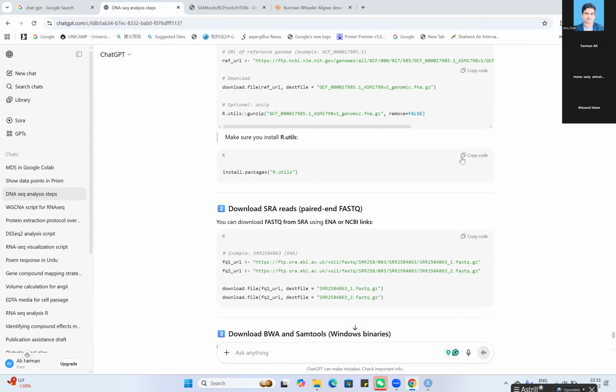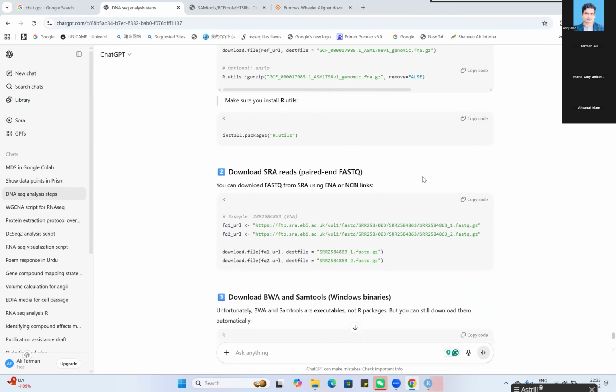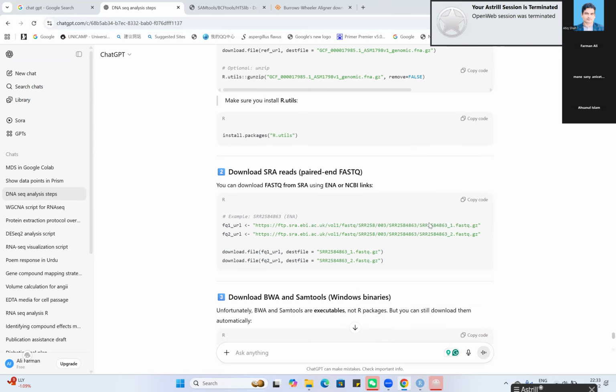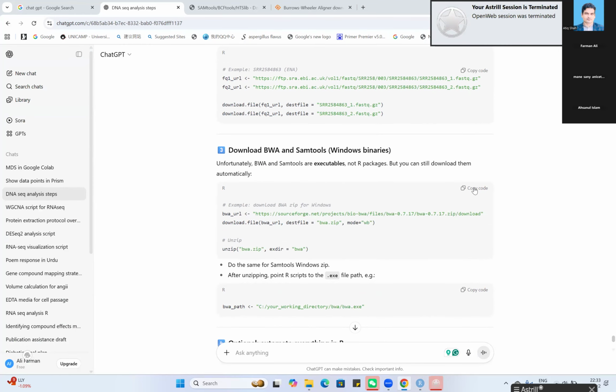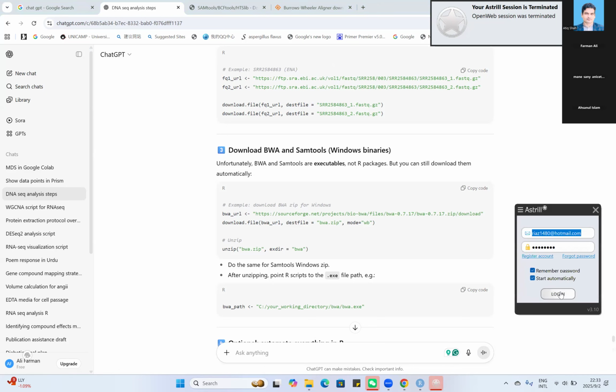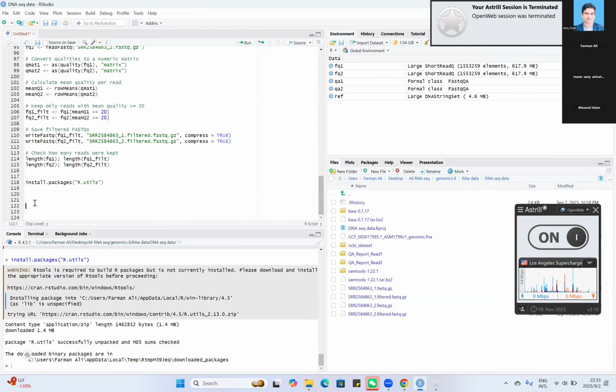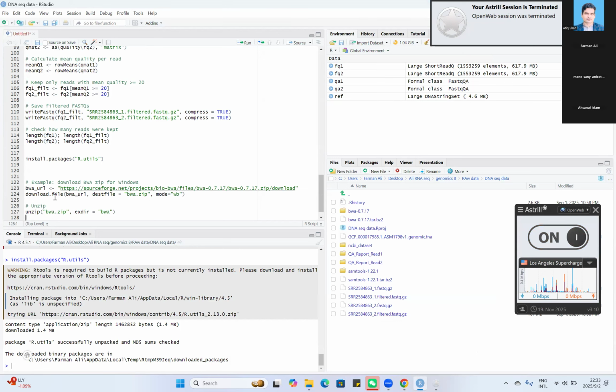Scroll down, not this one. Download BWA script. Yes, here is the BWA script. Copy, paste here, and run these one by one.